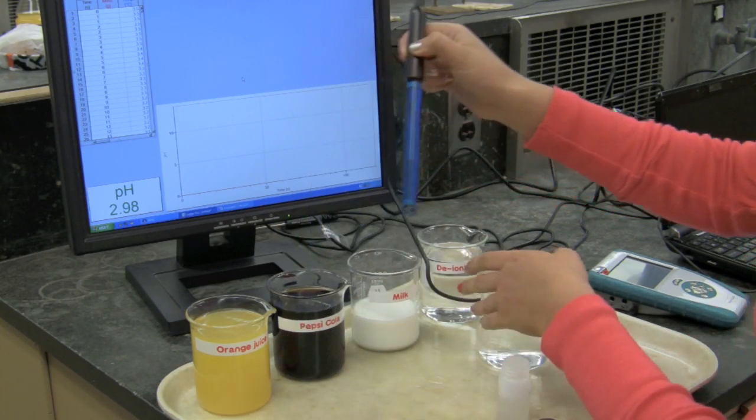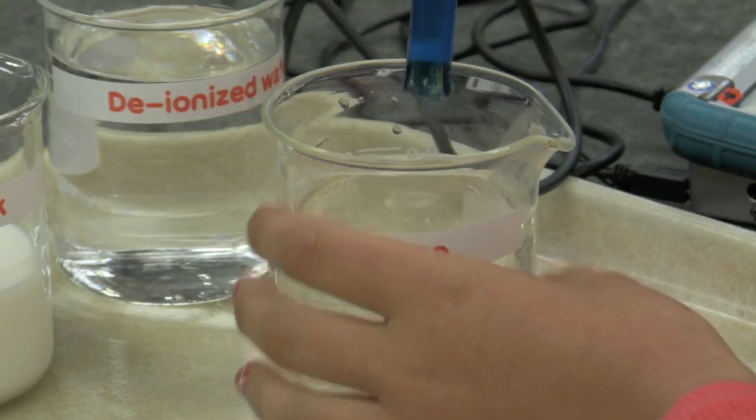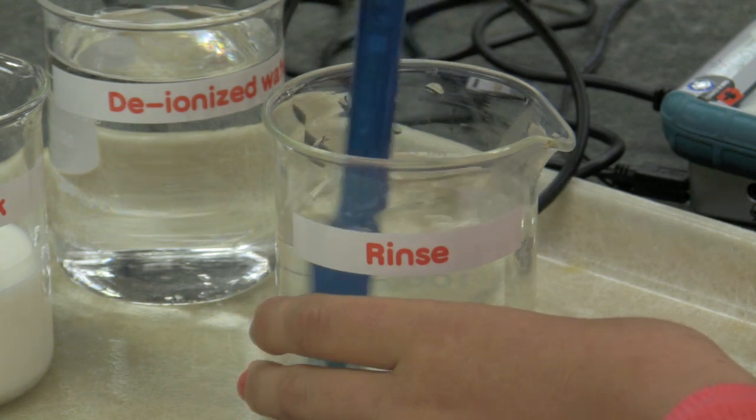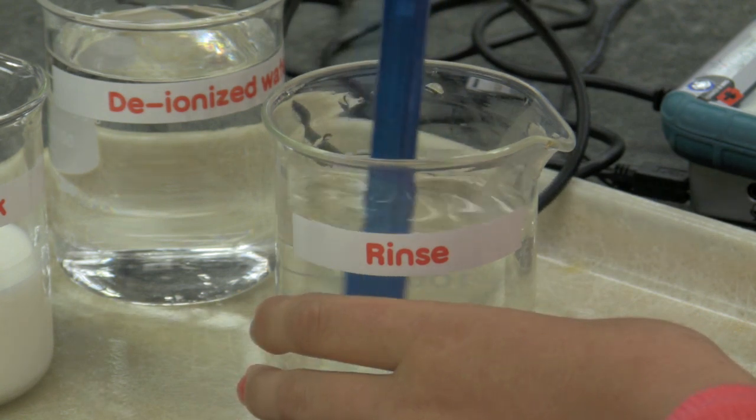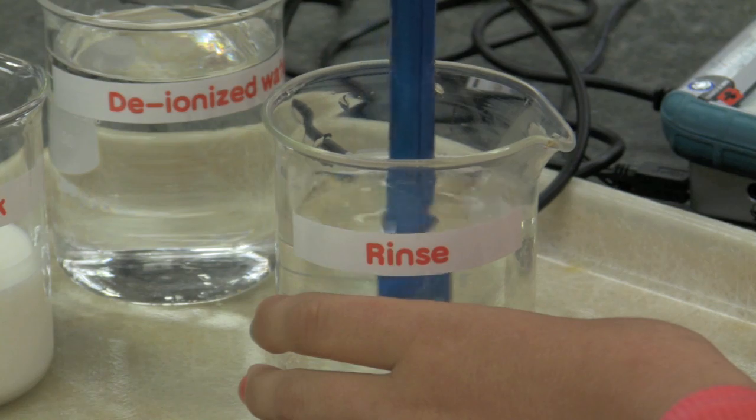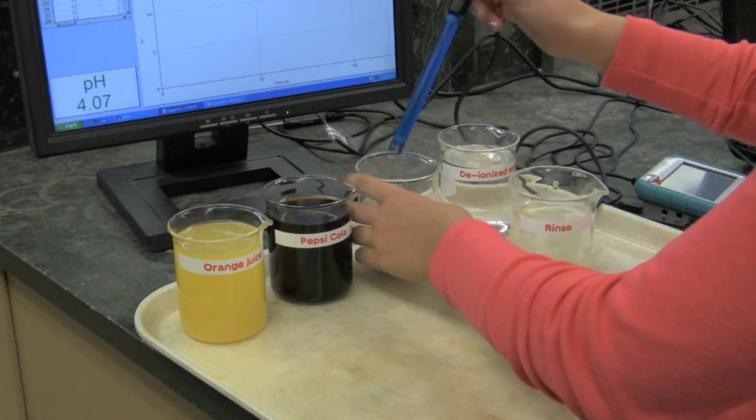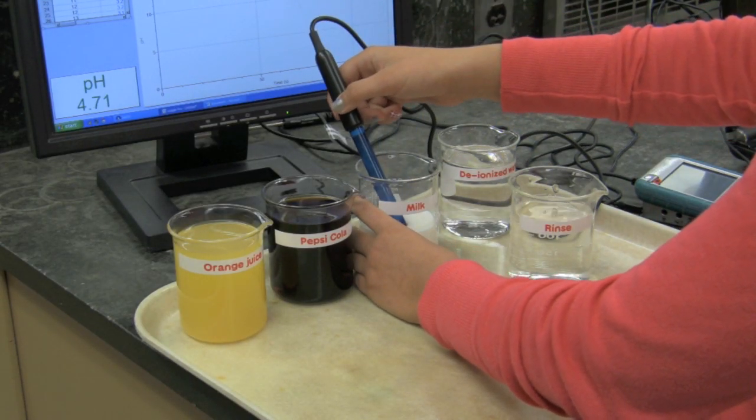She is removing the probe from the Pepsi-Cola and placing it in the rinse again. After a few seconds, she places the probe into a beaker of milk directly to the right of the beaker of Pepsi-Cola.